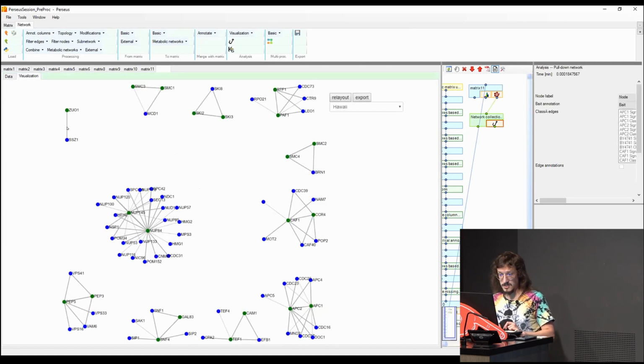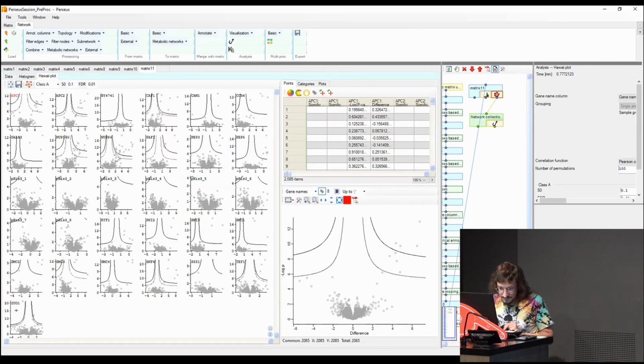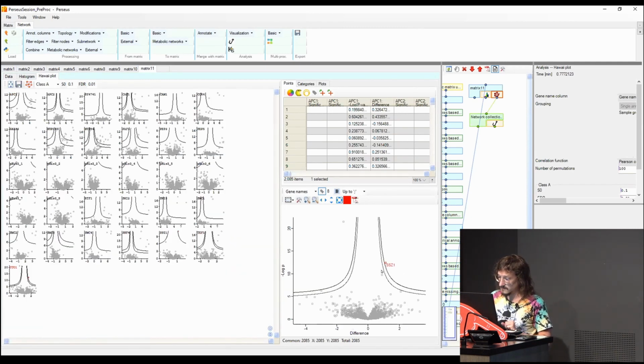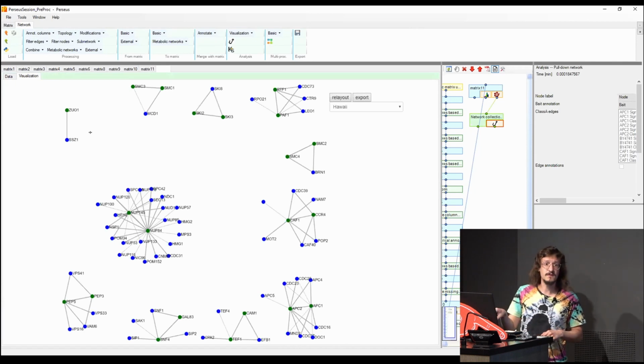But let's check, I don't know, this ZUO1 that has only this interaction. Let's go here. Let's check for that bait. Here it is. So what did the network select? This one. Not this one, because this one, as I said, is an error depending on the FDR that Jürgen mentioned before, the FDR that he used. The network selected this one. Is it for real? Let's see. Yes. It was only that one.